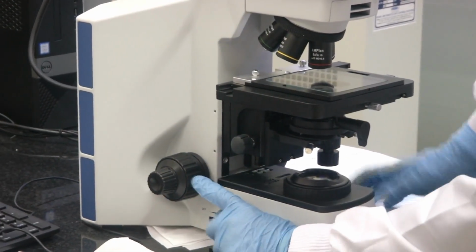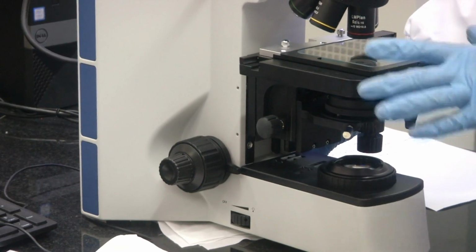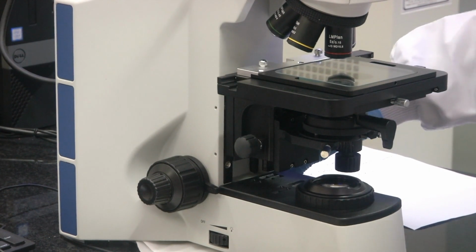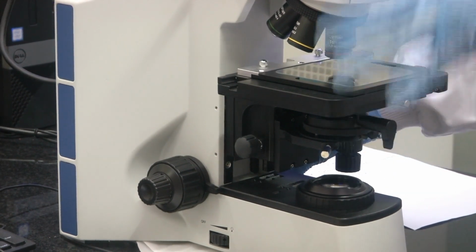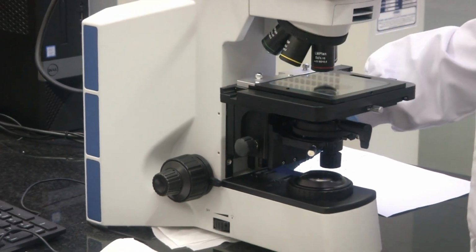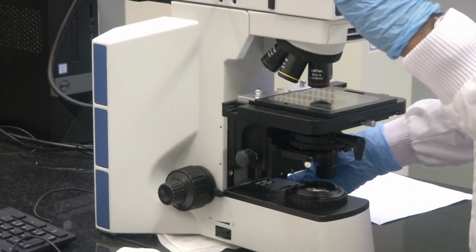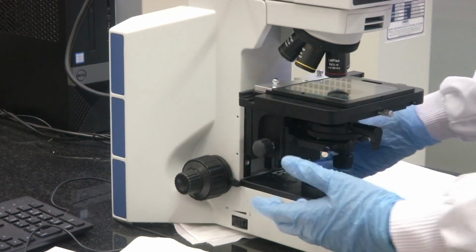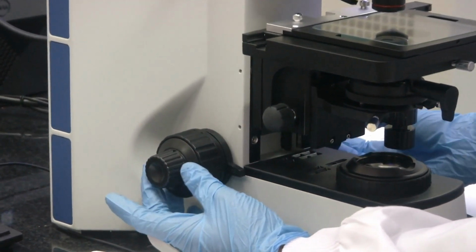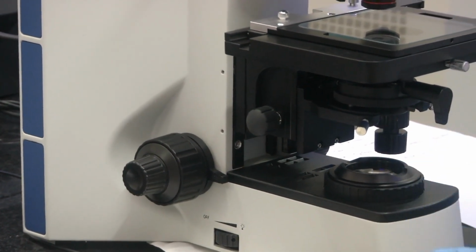Two knobs here. This knob is used for coarse adjustment of your focusing. As we had seen before, the stage we can move in x and y direction, but to focus you need to move your stage in the z direction, so that your sample comes into focus with respect to the respective objective that you have used in the turret. So you can have coarse adjustment, and once you know that your sample is reasonably in focus, you need to make it sharper, right? To make it sharper, you have fine adjustment here. This is used for fine adjustment of your focusing. We will see a sample shortly and know how this is done.